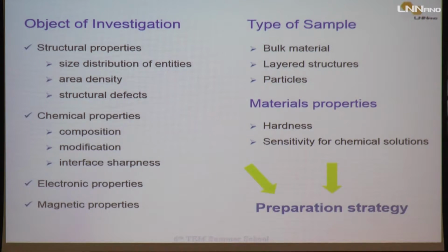Well, then, as I told you, we have to understand exactly what we want about the use of the machine, what kind of information you extract from the TEM investigation, okay, to define the perfect preparation strategy, okay? What exactly do we want to see about our material?